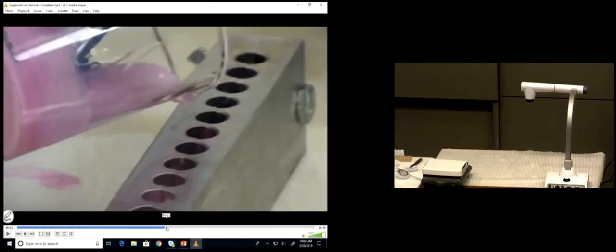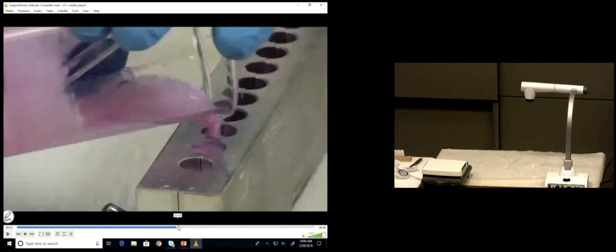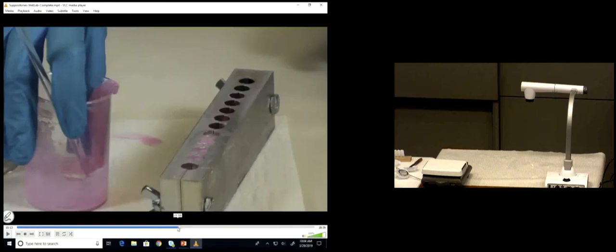And here she is rinsing and pouring, and rinsing and pouring, and she does it several times. But do you see right there, those second 3 in a row are too filled up? Would you agree? You can see that the rinsings are almost to the very top. So even that wasn't really well done. It would be better that they all look kind of like this first one, and these ones here, you can kind of see there's stuff in there, but they're not that high. So make sure you don't over-rinse and don't use too much rinsing volume. Do it 3 times at the most.